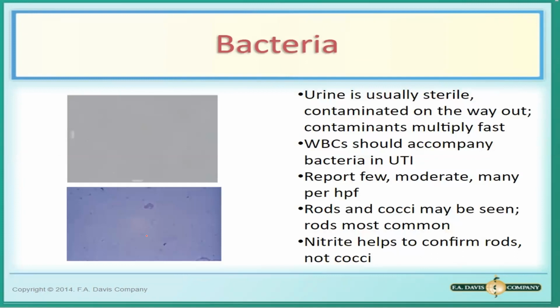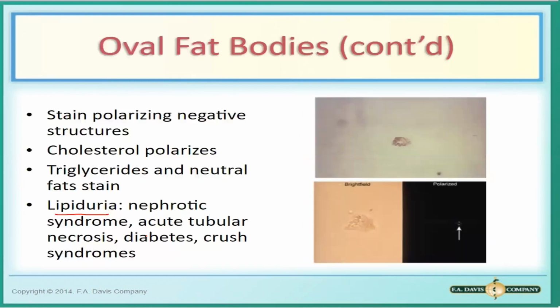And, wala na pala dito. Yung next in your handouts, second to the last na blank, that is lipid storage disease. The lipid storage disease causes the presence of large fat-laden histiocytes. And then the last one is bubble cells. Bubble cells are RTE cells containing large non-lipid vacuoles seen in cases of acute tubular necrosis.